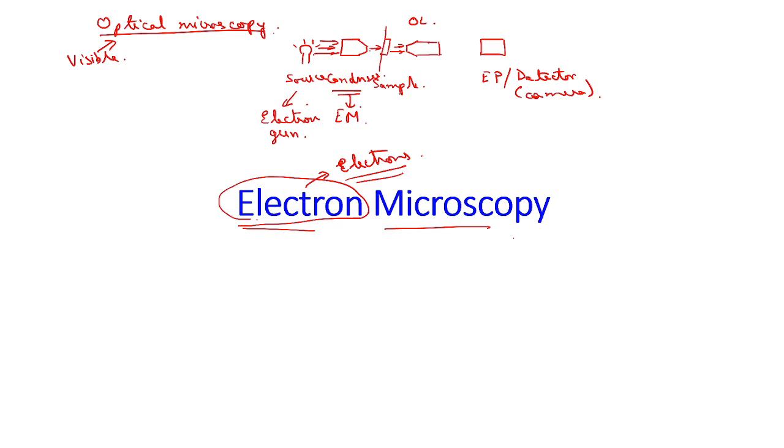Here also you will be having a sample stage. Then we will be having a set of objective lenses. In this case again the lenses are electromagnetic lenses.